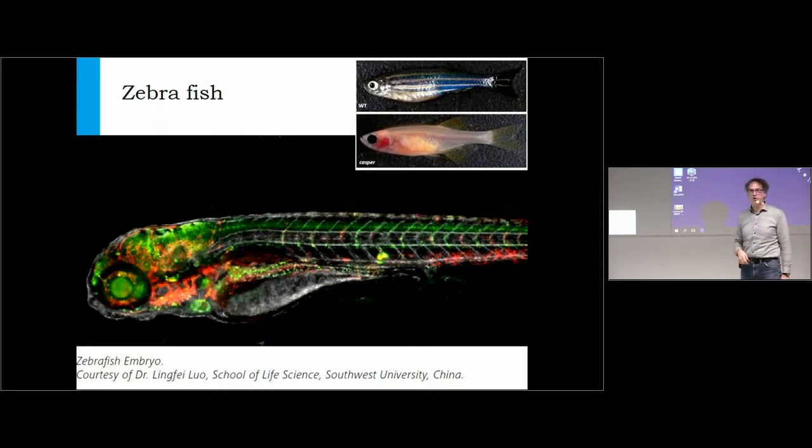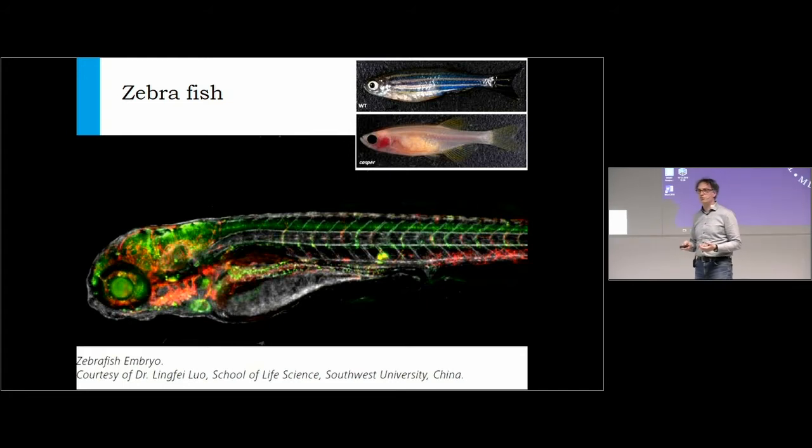So I want to give you some examples of things that we're looking at, and also why that might not be a problem to store that data or to work on that data and to manipulate this data. One of the largest things that you can image would be zebrafish with a microscope now. An adult zebrafish is on the order of a few millimeters to a few centimeters.